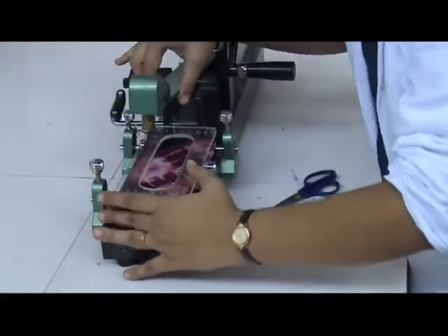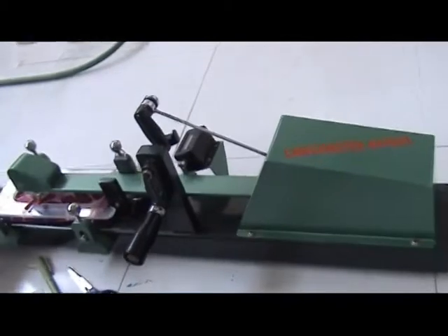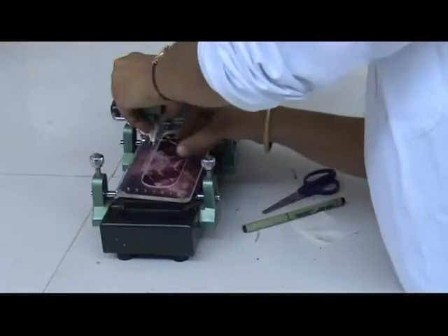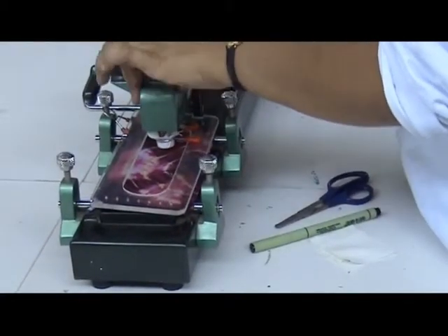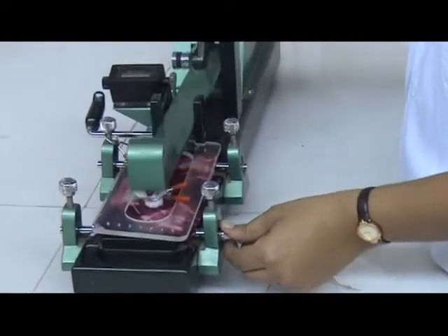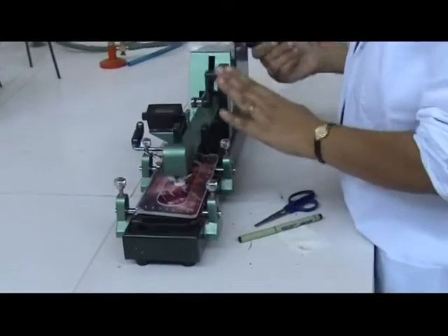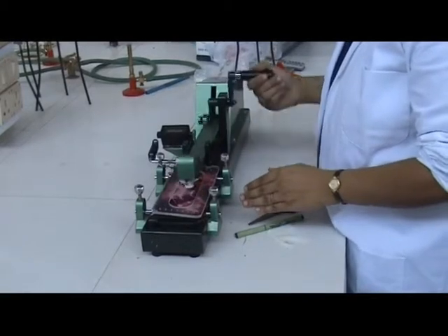In the case of printed fabric, the sample should be fixed so that all colors of the design are rubbed during the test. For the dry rubbing test, a piece of white cotton cloth, usually provided by the instrument manufacturer, is attached at the end of the finger of the crockmeter.